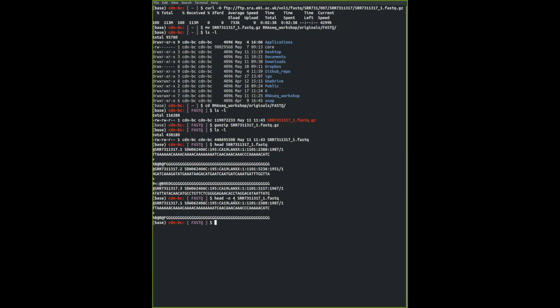A lot of this information you don't really use so often, apart from the fact that it's the first replicate of this sequence. And in paired-end sequencing, you need to have the pair in the other file, which we didn't download. But you can try it out and download the other files, which I have pasted on Etherpad, and make sure that the names of both reads are the same. The only difference is that the last number is a 2 instead of 1 because it represents the other read pair.